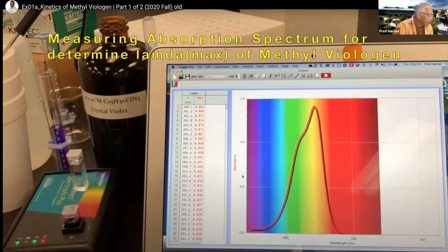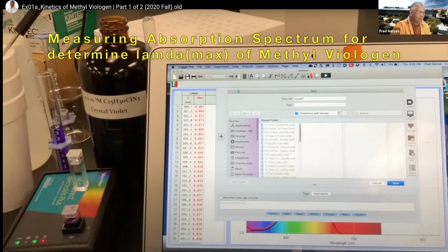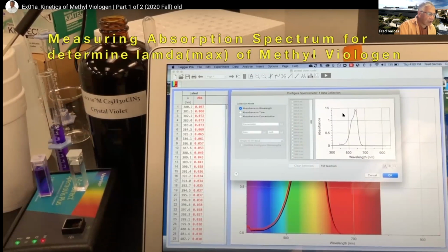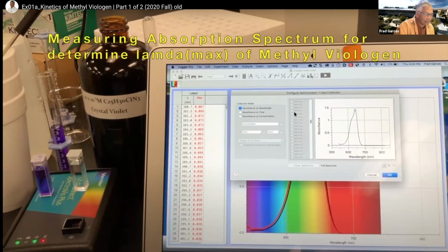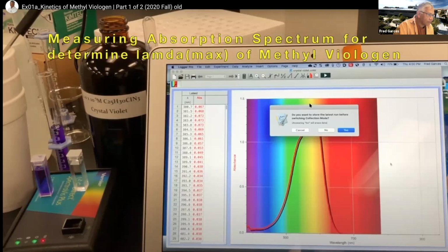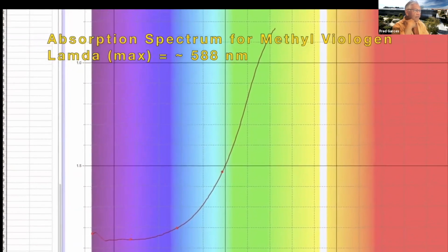So the way you do this is you run the SpectroVis and you run the whole thing. And now you can figure out what wavelength that is. Then you find the experiment that you need. This one was just a regular one. Right here, the program finds that, and in here are all the wavelengths from 300 to about 1000. It's going to pick that wavelength right here, and now you're going to monitor that wavelength. So that's the calibration process. Okay, we're going to sit at 588.